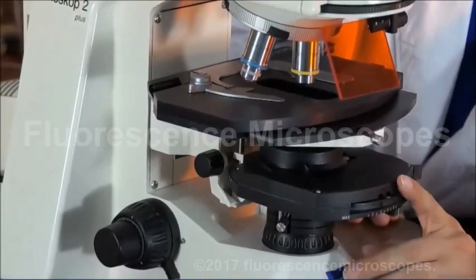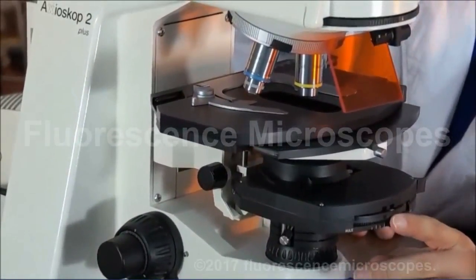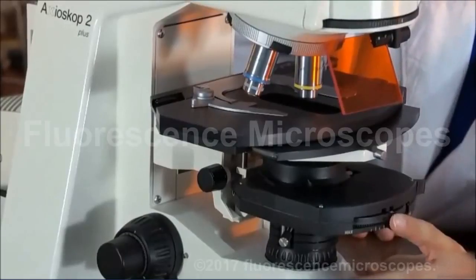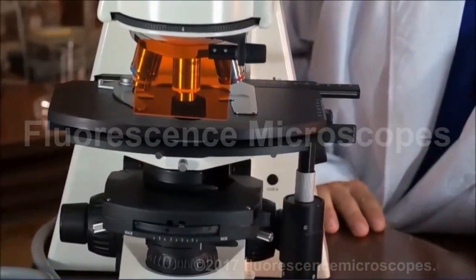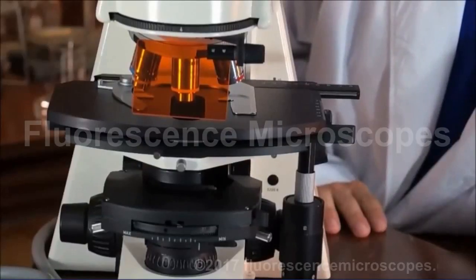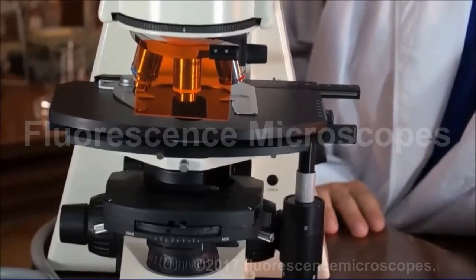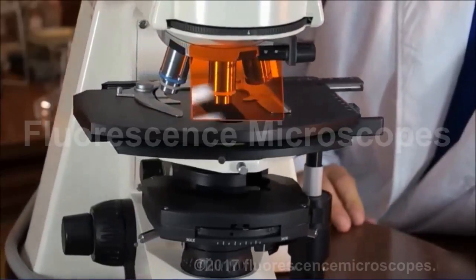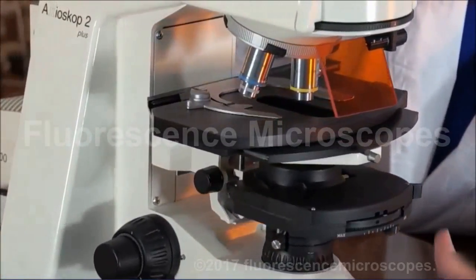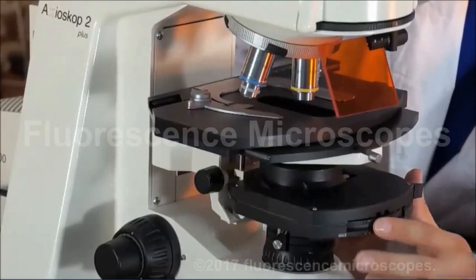Now we've got various settings on this condenser. For one thing, this microscope is upgradeable to DIC if you want to add it. Just let us know. But we don't have the DIC prisms in it at the moment. But there is a spot for the DIC prism number 1.